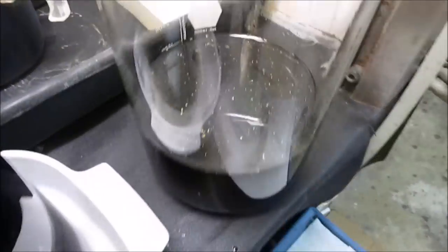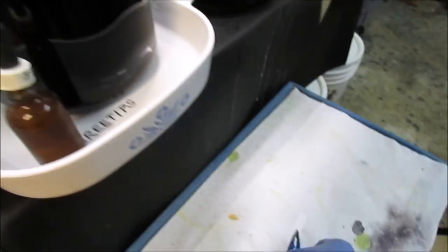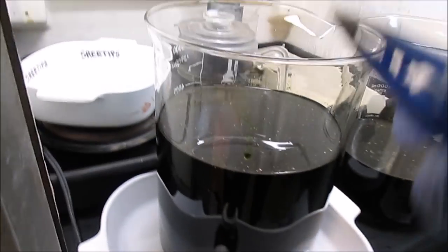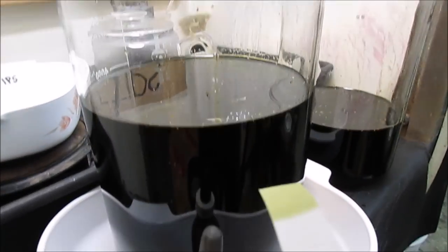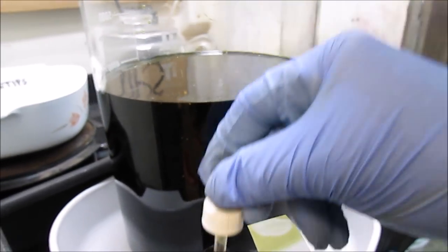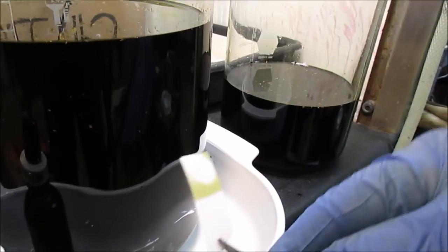Tiny gold foils floating on the top of both solutions, and I've got some little gold specks down in the bottom settling out on both beakers. What I'm doing now is go ahead and do a quick stannous chloride test here. Let's see what we get with this. See a bunch of gold in solution there.